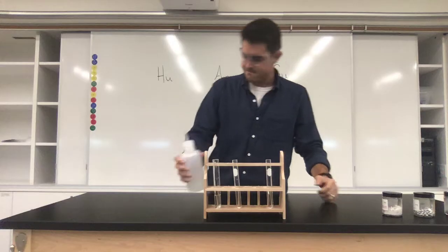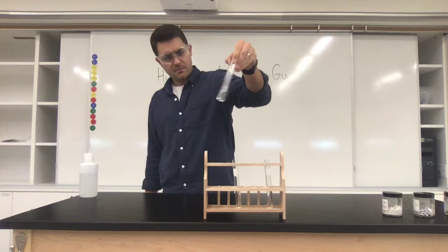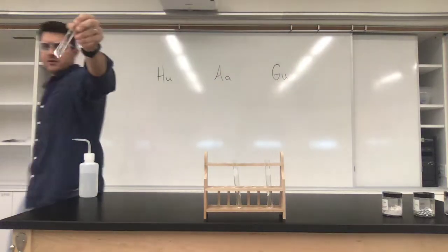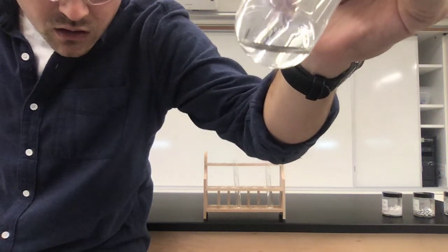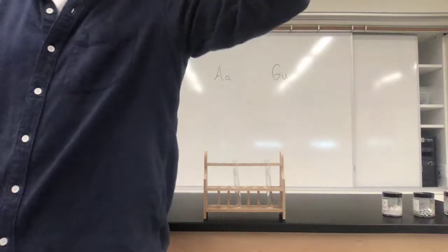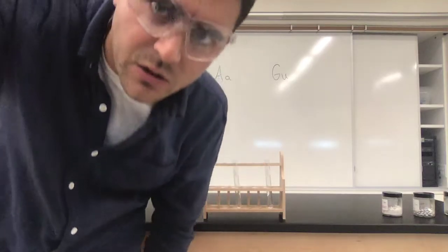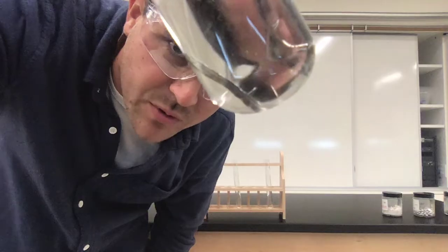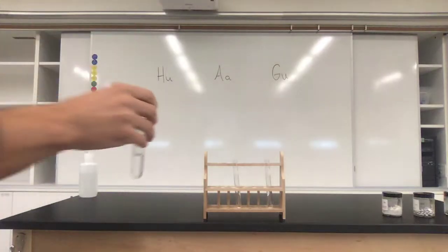Maybe we'll check back with that one and see what happens there. So far, take your observational data on Gustonium and what is going on in there. I'm going to add some water over here to Higsmith now. Let's take a peek at that one. I'll give it a little shake to try and mix it up. I'll bring it around so you can see. I'm not sure there's much going on in this one. It's just a little strip of metallic. It's silver or gray. If you get really close though, you can kind of see some bubbles.